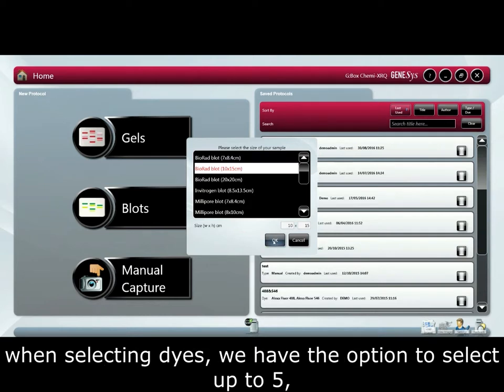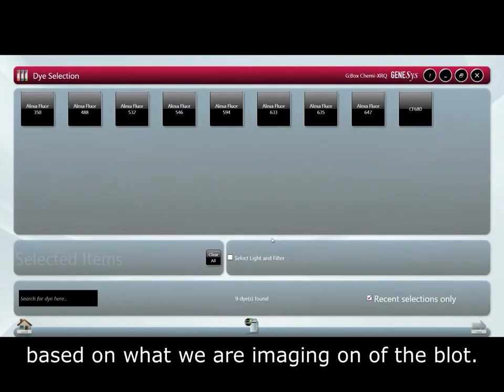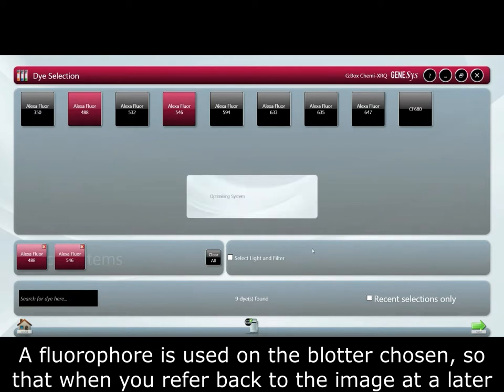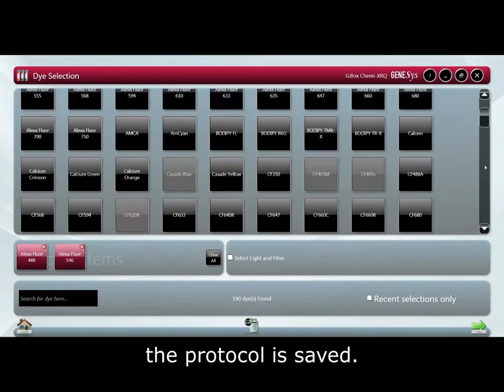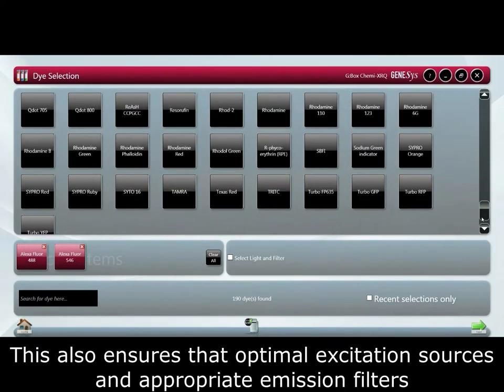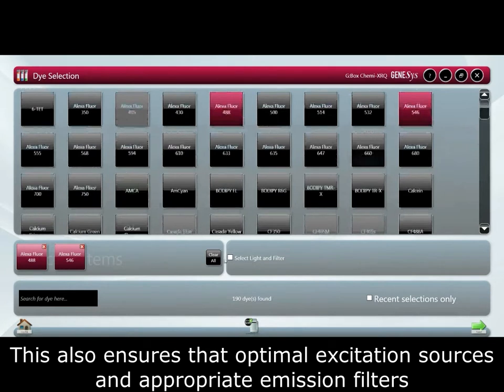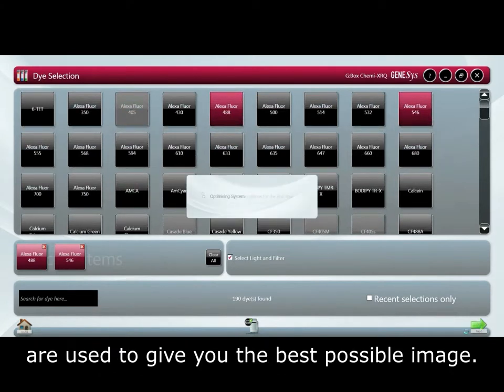When selecting dyes, we have the option to select up to 5 based on what we are imaging on the blot. The fluorophores used on the blot are chosen so that when you refer back to the images later at a later date, the protocol is saved. This also ensures that optimal excitation sources and appropriate emission filters are used to give you the best possible image.